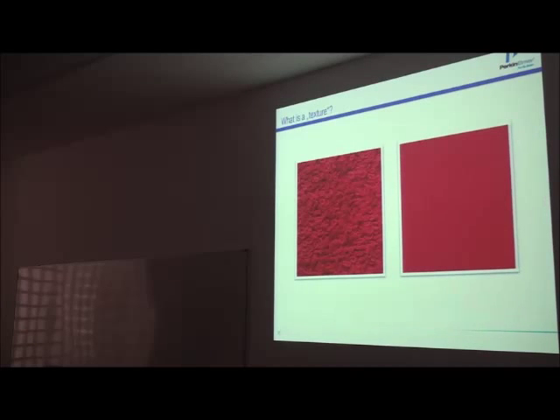If you look at these two images here, the kappa and tau, they look pretty similar when you look at intensity. When you look at morphology, they are exactly the same. You don't see any difference. If you look at the intensity, one will be lower intensity, but you will not see a very big difference. But if you look at the texture, that is what we recognize with our eyes, it is so obvious.